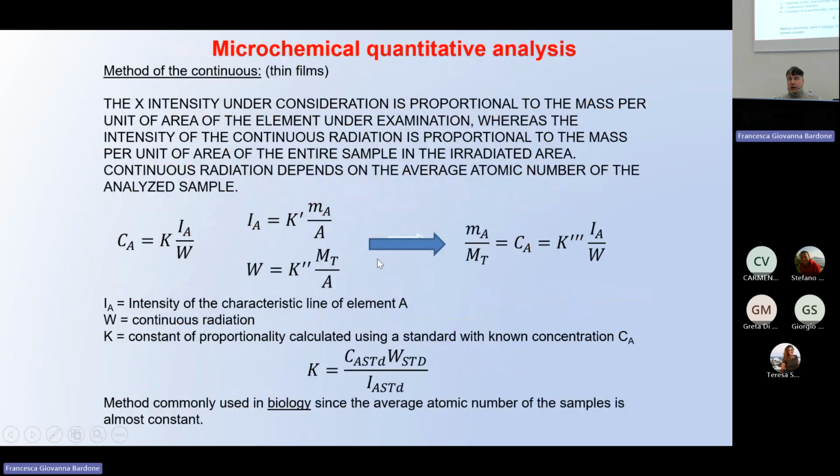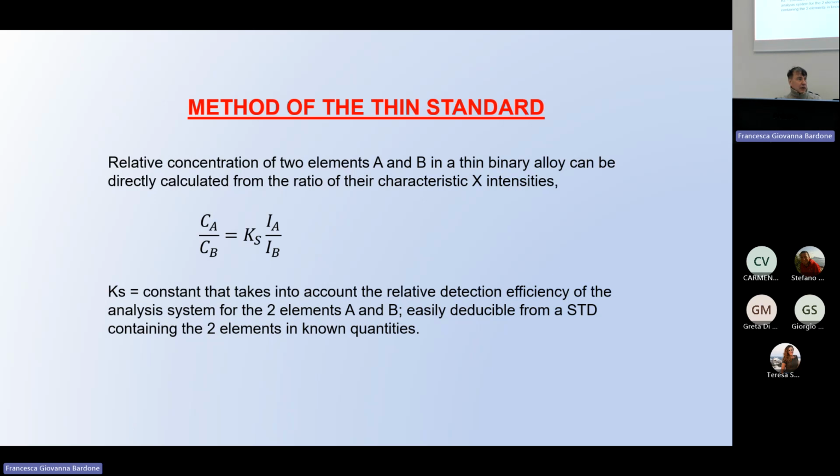There are a lot of programs for quantitation, using standards, using the background. I don't want to focus now on this part. There are a lot of programs to quantify the chemistry using standards and using simulation.